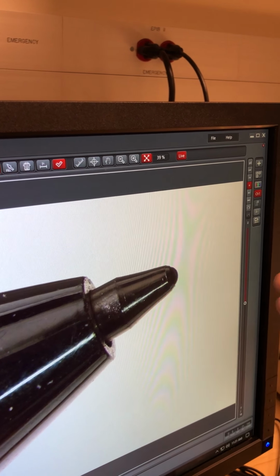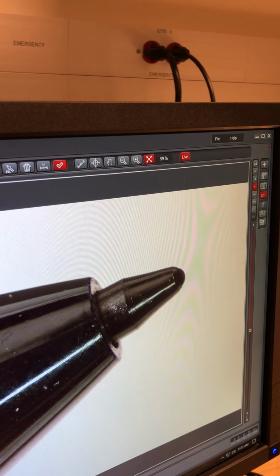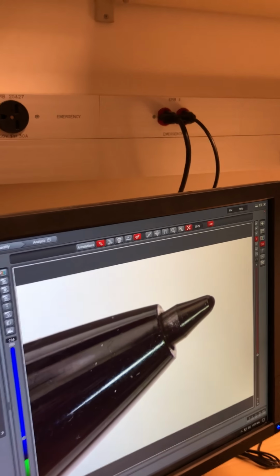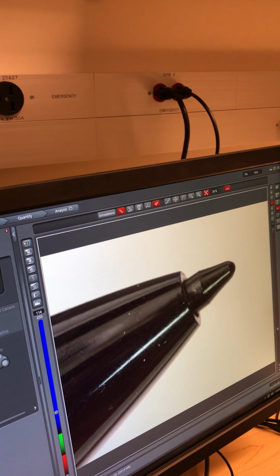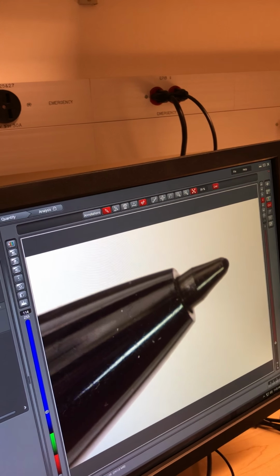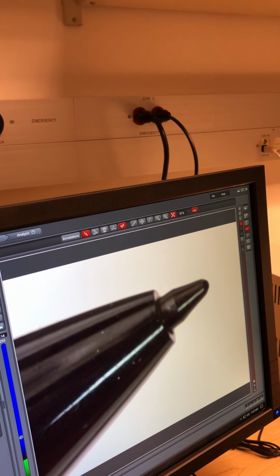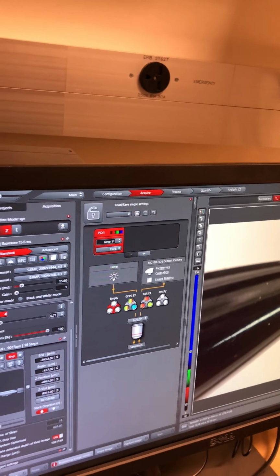You see how it's moving across the screen? Yes, it's because there's parallax, right? The right path is converging at an angle, so as it's moving down, the focal plane's moving with it. But then you can stitch them into one XY image with a depth of field. Yeah, I'll show you. All right, so it's then acquiring.